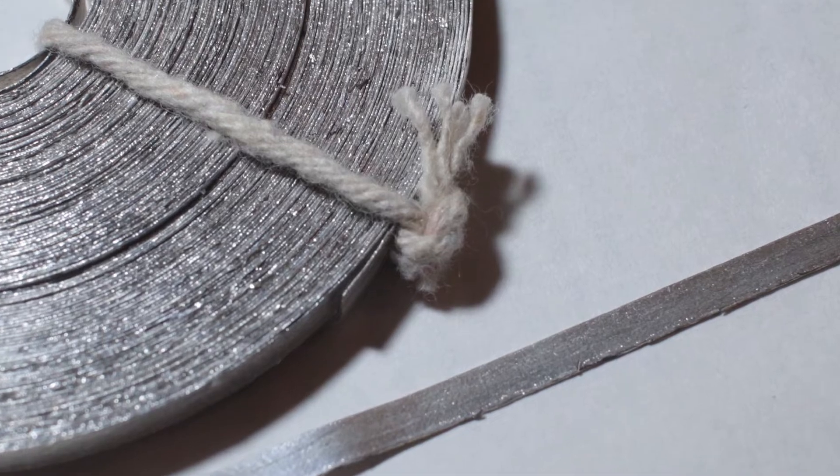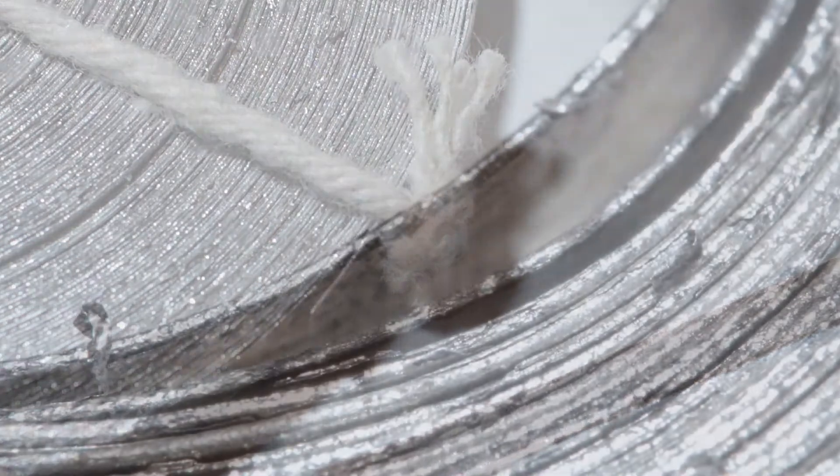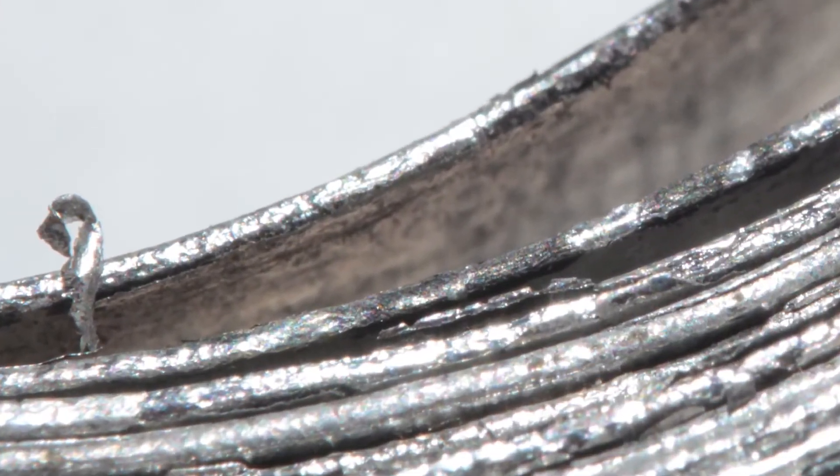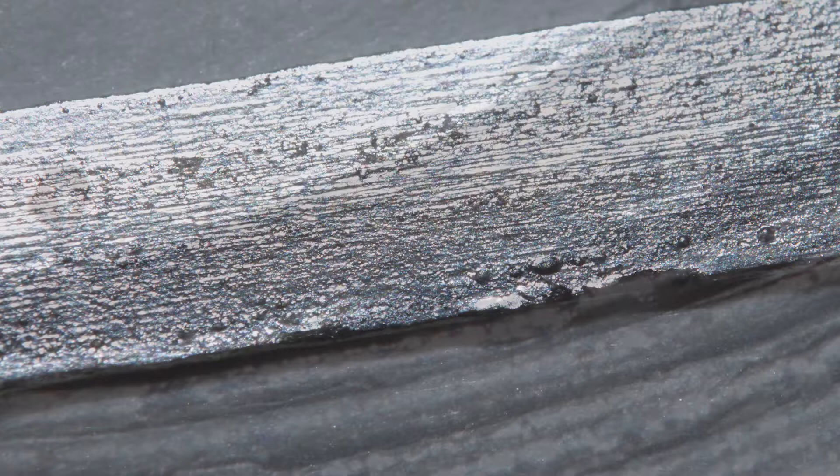Magnesium metal is gray and shiny, as you would expect. Here is magnesium ribbon and here is magnesium strip.